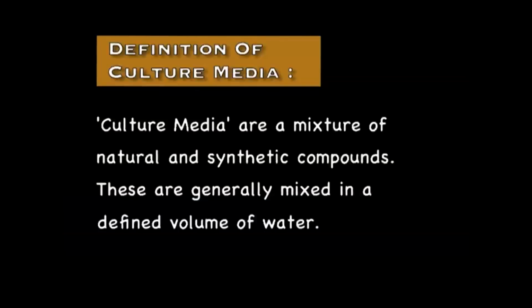Now generally the culture medium serves plenty of functions. So let us first see what the definition is. The definition, as I told you earlier, is a mixture of natural and synthetic compounds. The natural and synthetic compounds are generally mixed in a defined volume of water. If it is a liquid culture, then the type of your growth medium will be different.